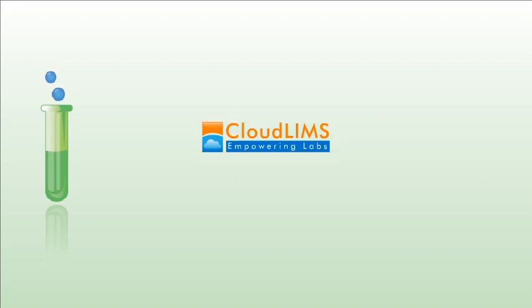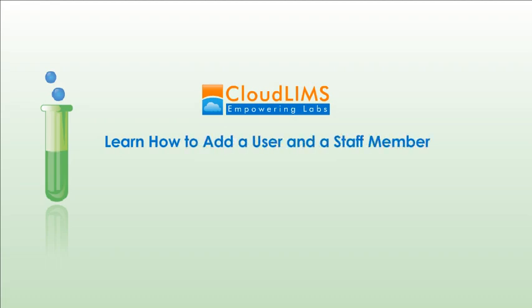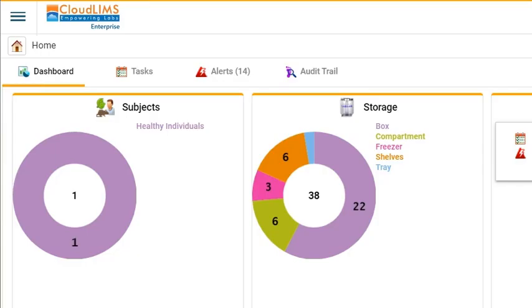In this video, we will walk you through the process of adding a new user and a staff member. A user is a licensee of CloudLIMS who can access the application and can perform activities based on the assigned rights, whereas a staff member is not a licensed user of CloudLIMS and cannot access the application. Records of staff members are saved in CloudLIMS for tracking purposes only.